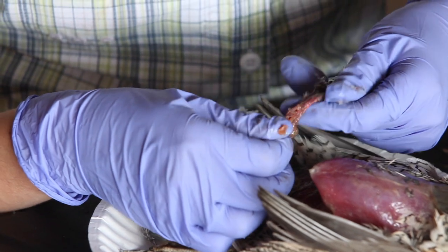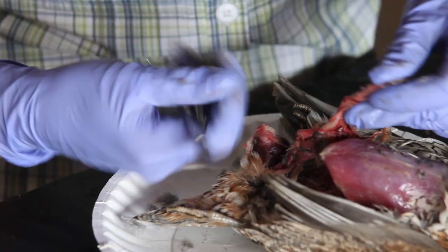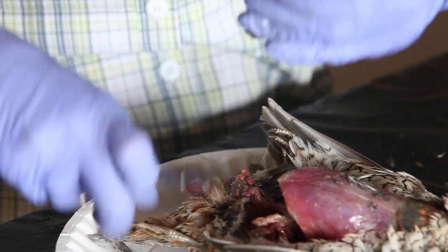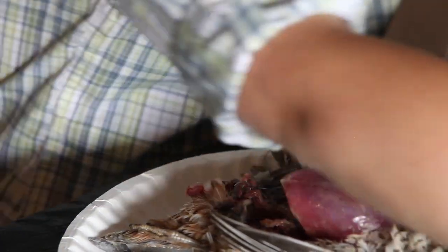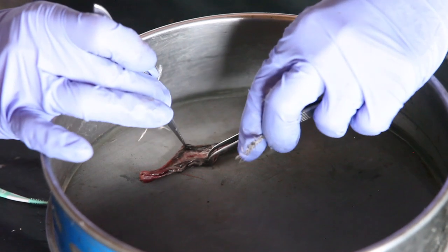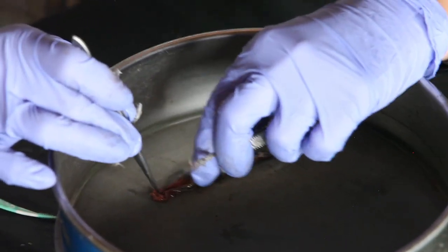And it's going to join with the small intestine. So you just want to follow it, find the one end where it joins with the small intestine, cut it, and then it's got these tails at the end. You're going to cut that. And then we're going to take this and lay it out flat in our sieve. So once I've got it laid out, I'm going to separate it into the three tracts. So the small intestine and then both ends.